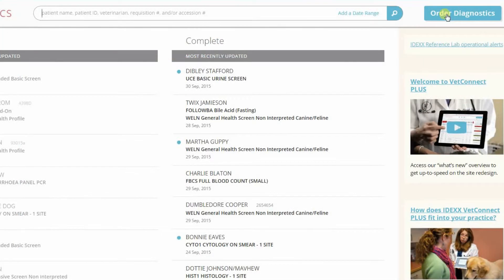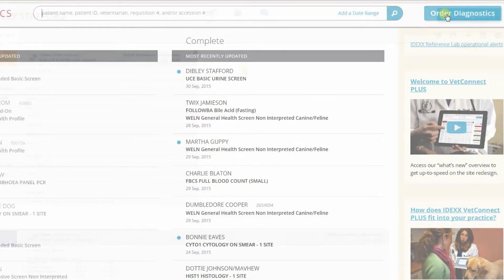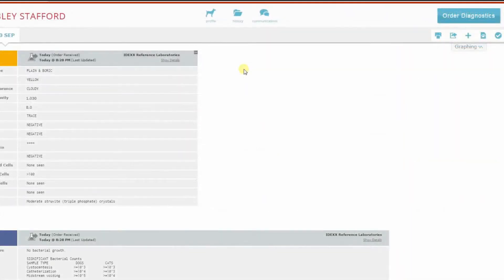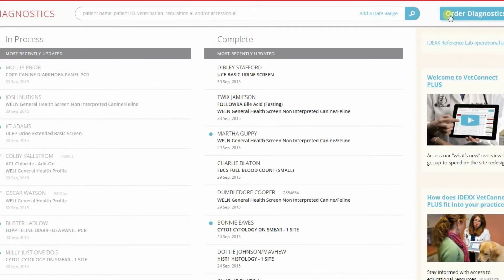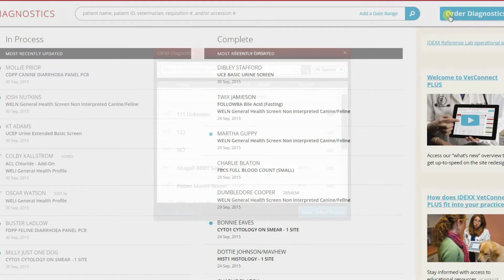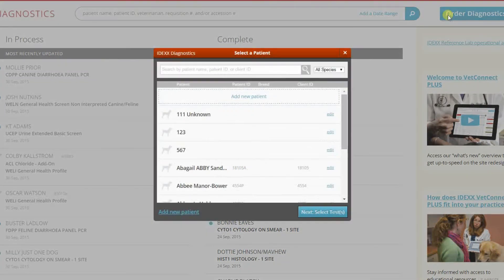You can also start the order using the Order Diagnostics button on the homepage. To place a batch order request, simply select the dropdown or from the patient results page. When ordering from the directory of services or homepage, you'll be asked to select a patient first.